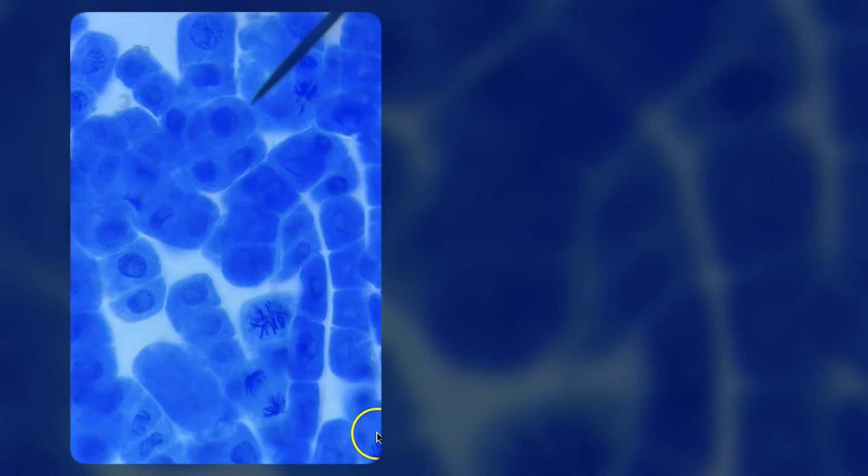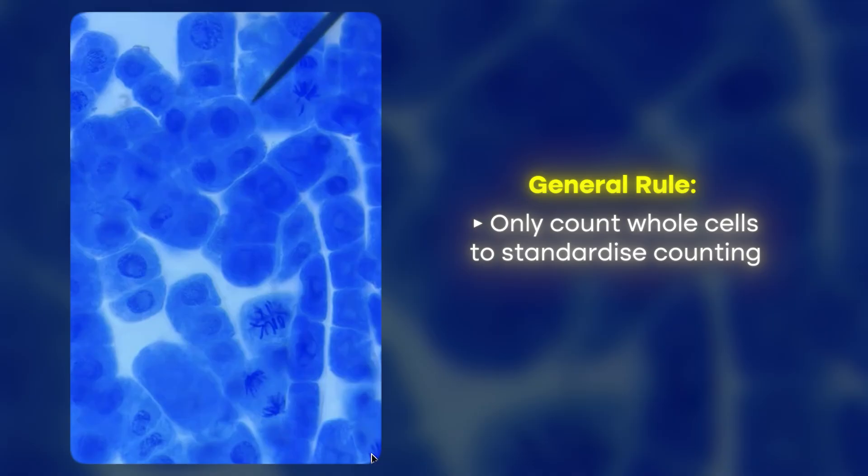We've got another one up here in anaphase. As for all of the rest, I can't see any others where there are visible chromosomes. There is one here, but because the cell is half included, half not, you wouldn't include it in your count. I would give that as a general rule to the students, unless there is an entire cell in view, do not include it.